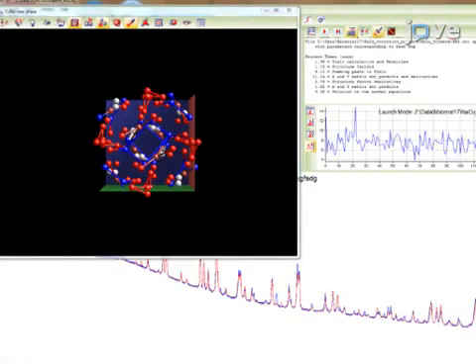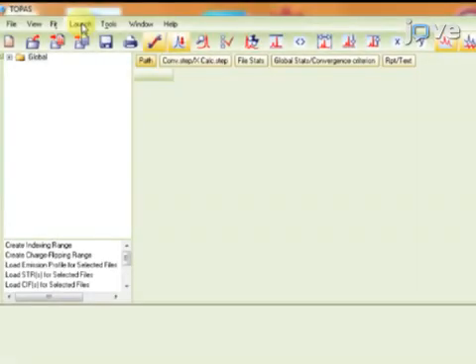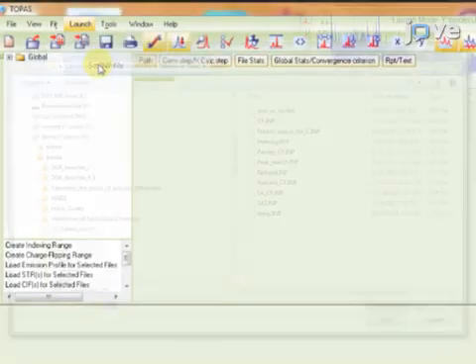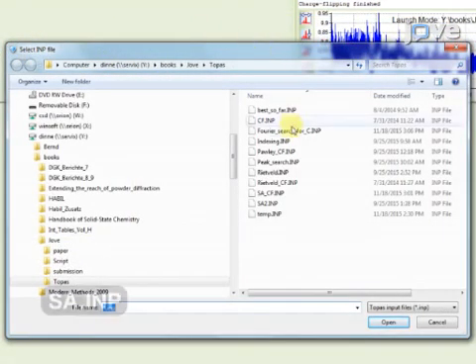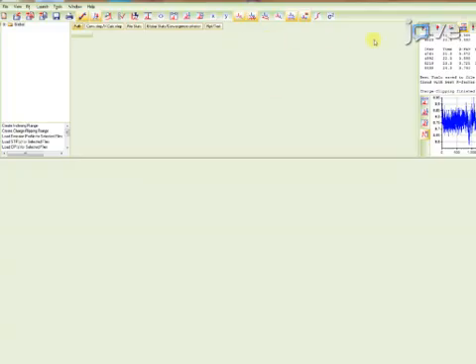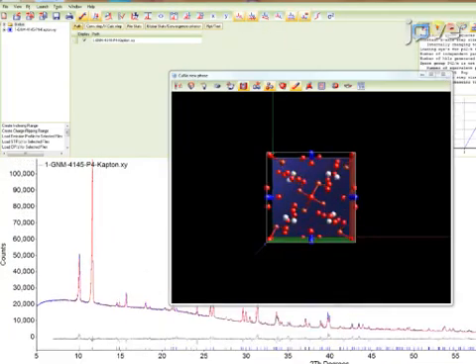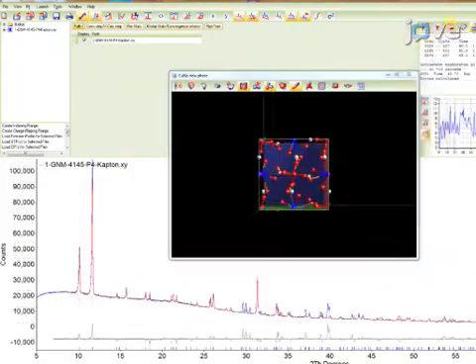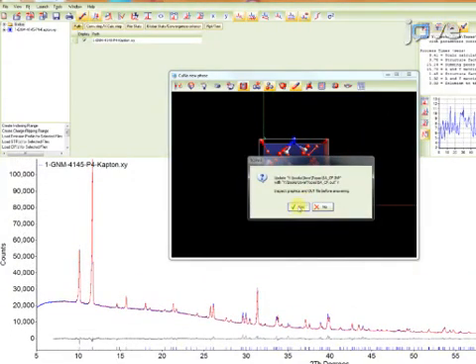The next step is to apply the global optimization method of simulated annealing to find the positions of all missing non-hydrogen atoms. From the Launch pulldown menu, select Set INP File, and then choose the prepared input file. Press the Run button, and after several thousand cycles, press the Stop button and click Yes.